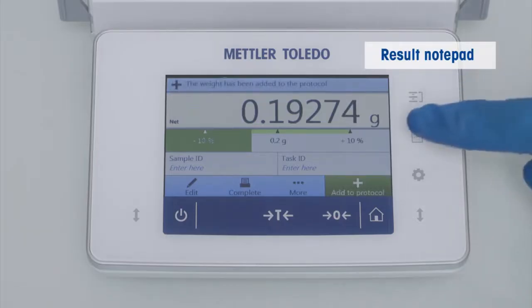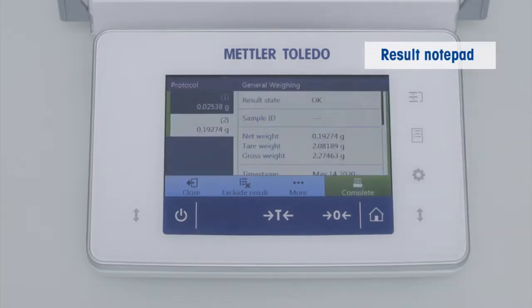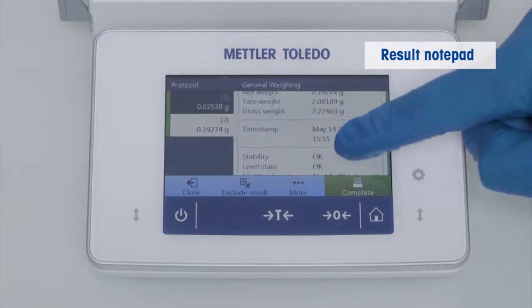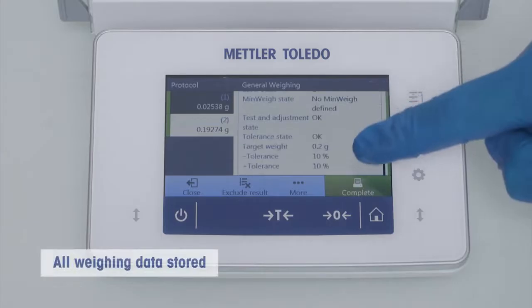It can collect and display multiple results including relevant metadata like level status, timestamp, etc., indicating the validity of individual results.